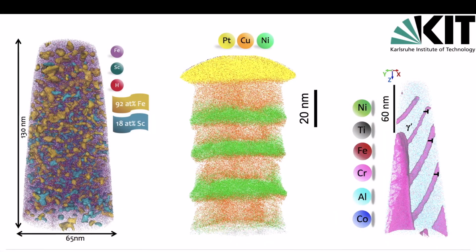So after atom probe analysis, you basically get a 3D virtual volume of all the atomic positions with a sub-nanometer spatial resolution and with all the chemical identities, which allows you to do different sorts of analysis which can address a wide range of materials problems.